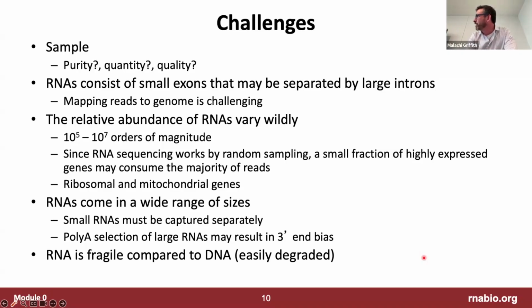So you have some genes that just really don't need that many copies of the transcript to make enough copies of the protein, or the protein is really stable and you just make a little bit of it and it lasts a long time, or you just need it now and then, so there's a little pulse of it and then it's not around for a while. All of these things complicate the interpretation of the data and make generating the data for a comprehensive view of the transcriptome much more difficult, because we don't get to choose what transcripts we sequence. It's a random sampling process.